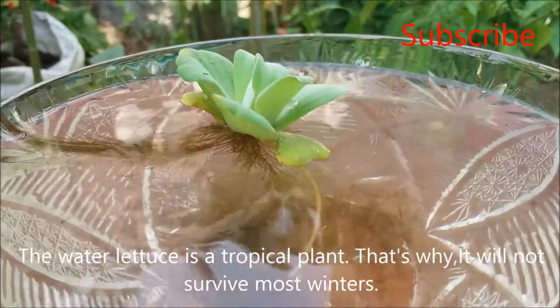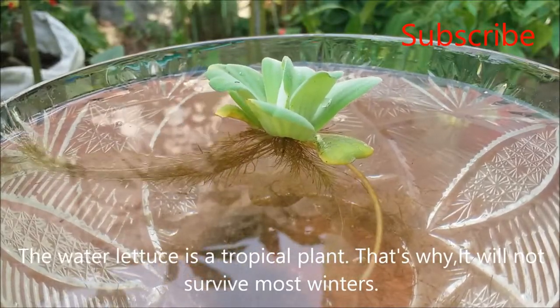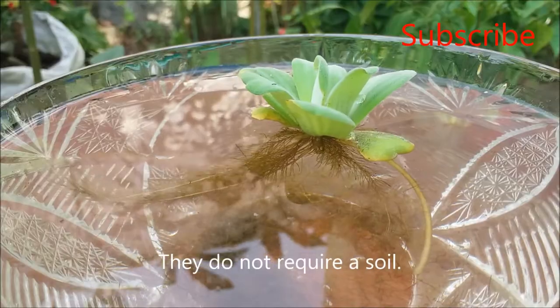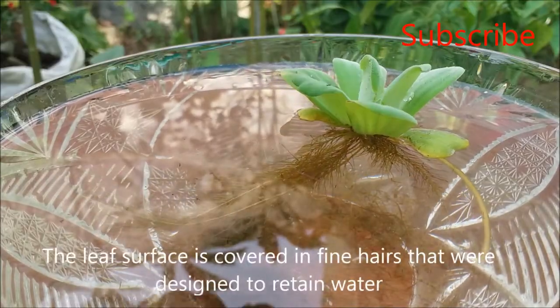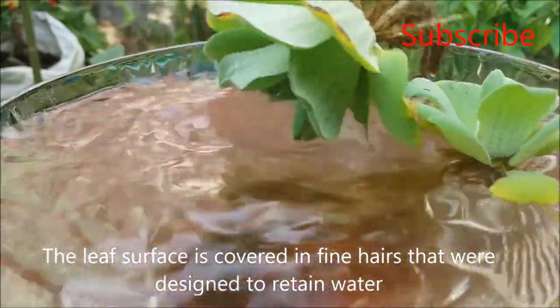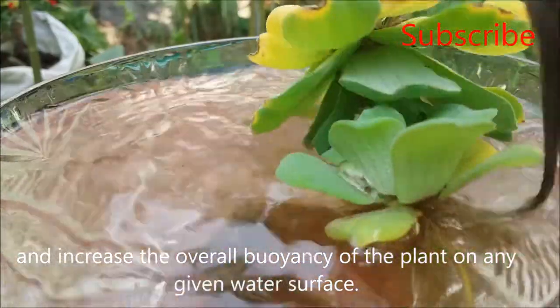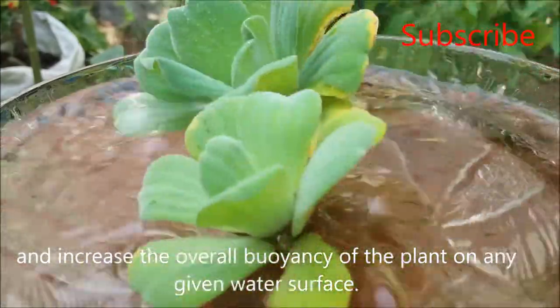Water lettuce is a tropical plant, that's why it will not survive most winters. They do not require soil. The leaf surface is covered in fine hairs that were designed to retain water and increase the overall buoyancy of the plant on any given water surface.